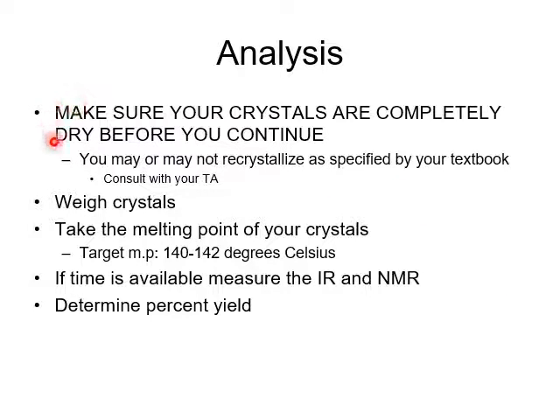Again, you have to make sure that crystals are completely dry, and you have to know why, right? If you want to talk more about that, you should email me. For recrystallization, if you're not aware of what that is, you should review what that is. And you have your textbook to consult, or you can also consult with me again.